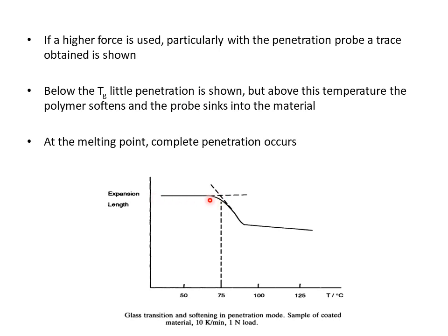Before glass transition, there is a very small penetration, but above this temperature, the polymer softens and the probe sinks into the material. So we get this curve.